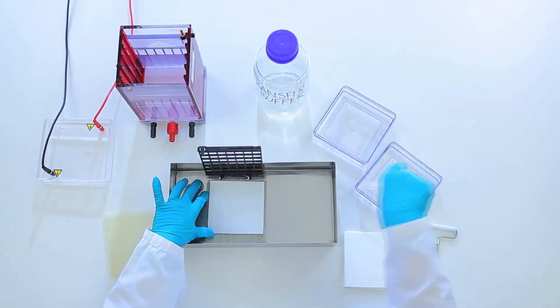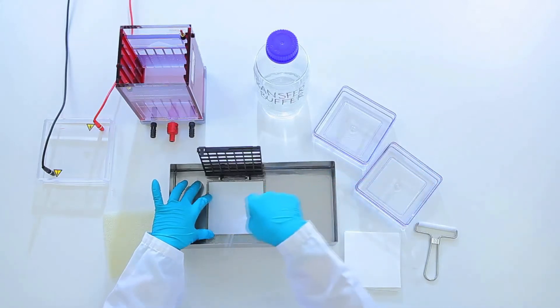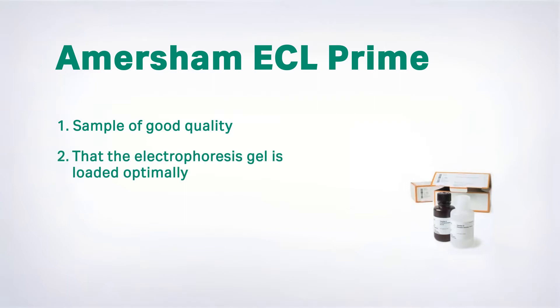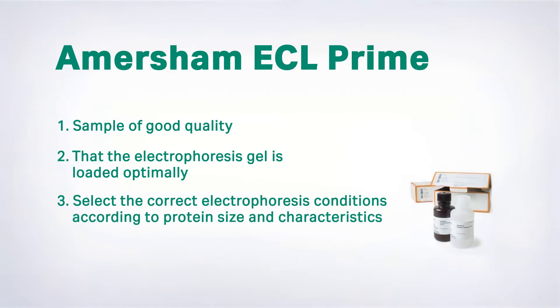To ensure good results, here are three things to think about before you start. One, that the sample is of good quality. Two, that the electrophoresis gel is loaded optimally. Third, that you select the correct electrophoresis conditions and wet or semi-dry transfer method according to protein size and characteristics.